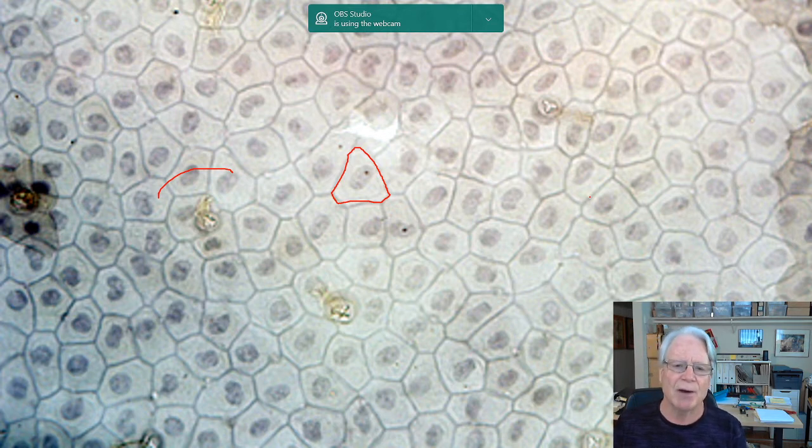So no matter how you see it, you'll be able to identify it. I guess the best way to talk about this is to say, okay, if I show you a car, and I only show you one car, let's say a Mustang, and then I say this is a typical car, and I just show you the Mustang over and over again, you may not be able to say to yourself when you see a VW Bug or a Maserati that, oh, that's a car.